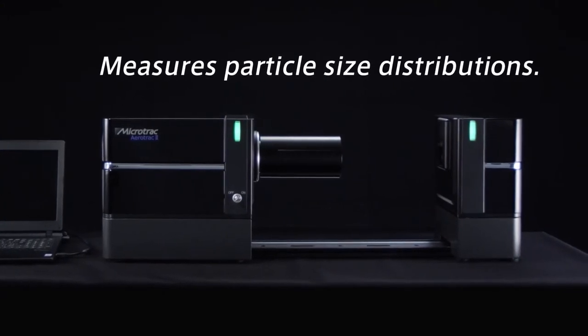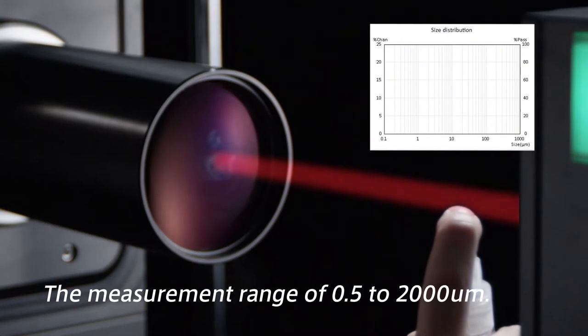The measurement range of Aerotrack 2 is 0.5 to 2,000 micrometers.